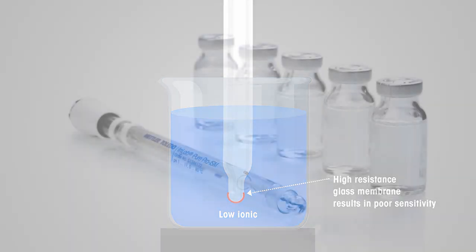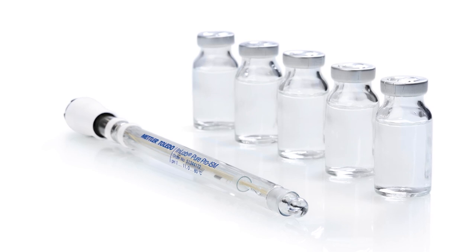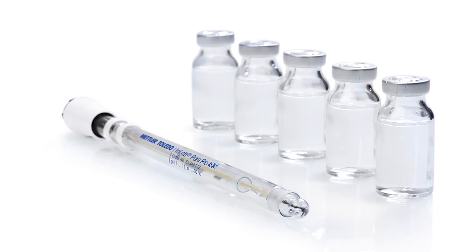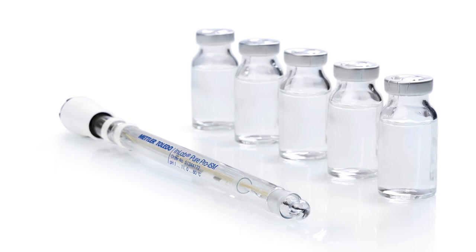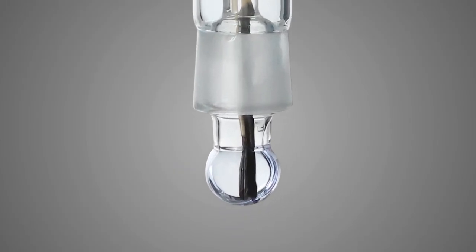Mettler Toledo offers a specialist sensor — the InLab Pure Pro ISM — for pH measurement in low ionic and pure water samples. This sensor has a pH-sensitive membrane made of LOT glass, which has low resistance and a spherical shape to offer a large sample interaction surface. This results in fast response time and measurement of even very small changes in hydrogen ion activity. The sensor also has a glass sleeve that allows a steady outflow of the electrolyte.